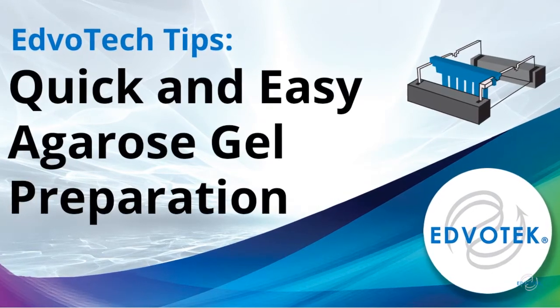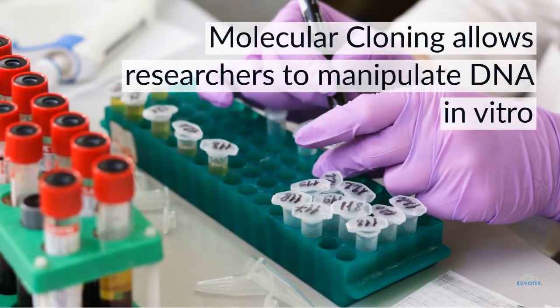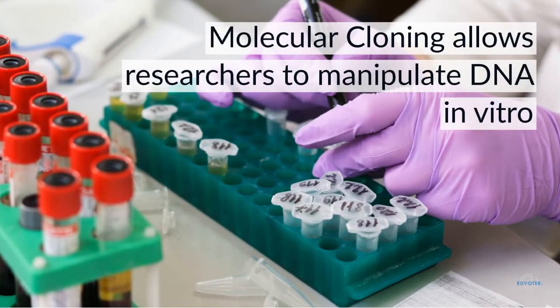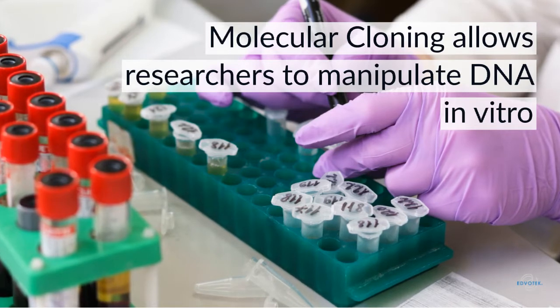Edvotech Tip: quick and easy agarose gel preparation. Molecular biologists study the molecules of life — DNA, RNA, and protein — and how they interact within a cell and an organism.